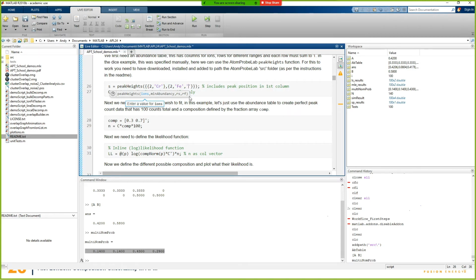If we wanted oxygen in here, so iron oxide, we could add O. If you want two of those, we just add a 2. It assumes there's a 1 if you just add another element at the end of it. So it's reasonably natural, but it's verbose enough that later on I'll show you how you can just write something like Fe2O++, and then, using the rules that elements are only 2 or 3 characters long and a number of pluses, it can figure out what ion it is.